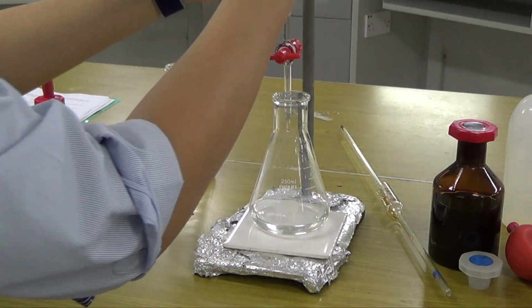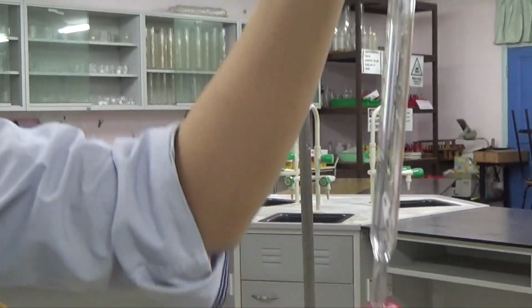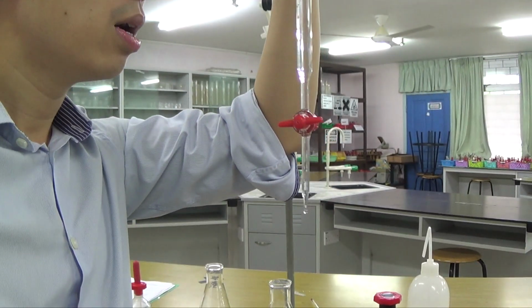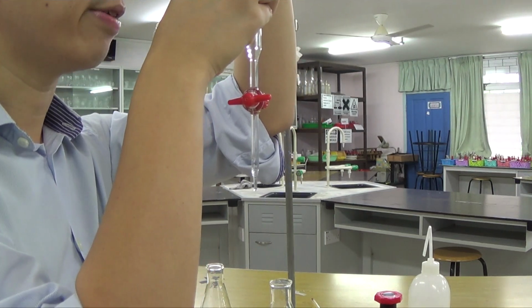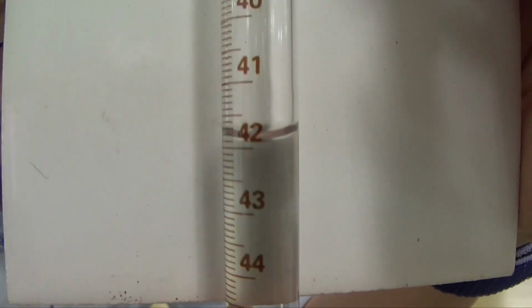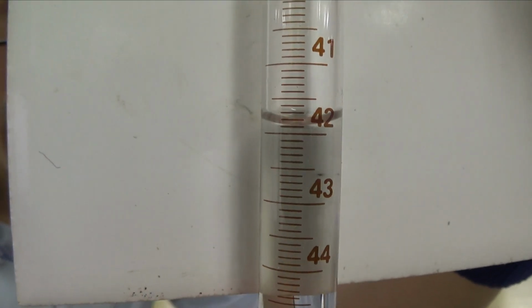Okay? Now ready to read the reading of the burette. So there's my endpoint, there's my accurate endpoint. I knew it was accurate because I did it drop by drop. So that is 41.9 cm cubed. You should hopefully see that, 41.9 cm cubed. Let me just twist it around. So 41 on top there, 41.9 if you read below the meniscus there. Okay, 41.9 cm cubed.